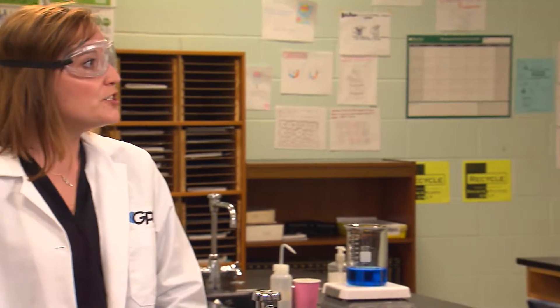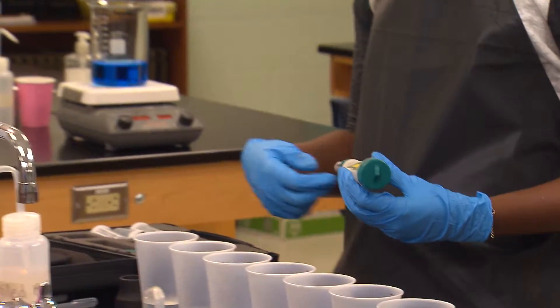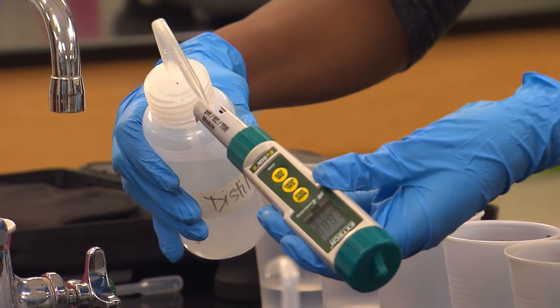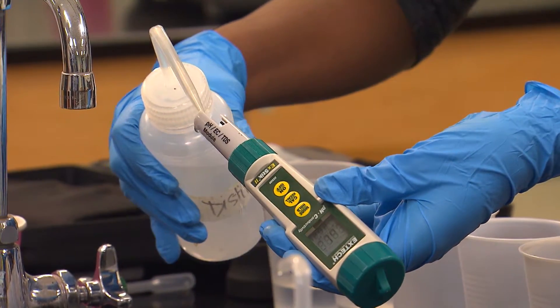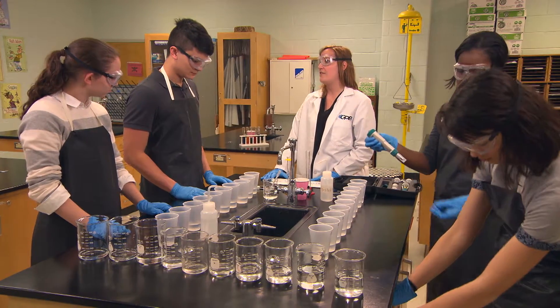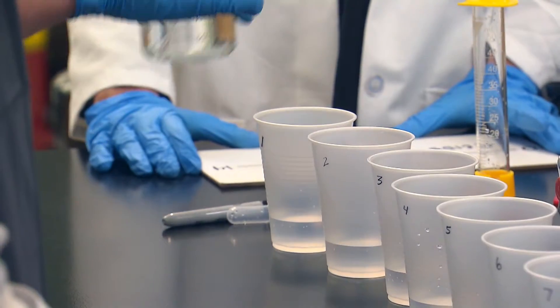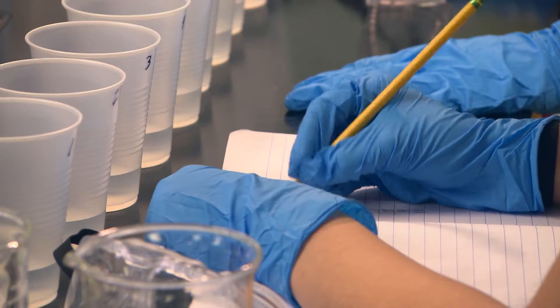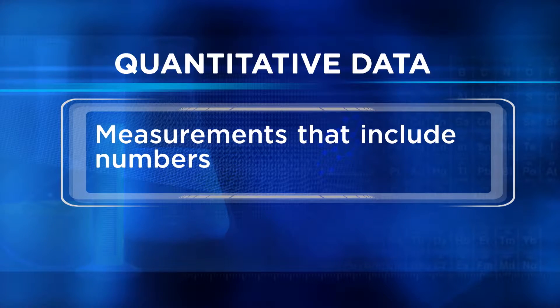Now you're ready to use the pH probe or pH indicator to test for the presence of acids. Team one, please turn on your pH probe and rinse the tip with distilled water, and dip the tip in water sample one until you see the pH of the solution appear on screen. Then record the pH level in your lab book. Team two, please use the pH indicator and add five drops to each water sample; record any observed color changes. Notice that team one is recording pH numbers — since they'll have numerical data, their measurements are called quantitative.